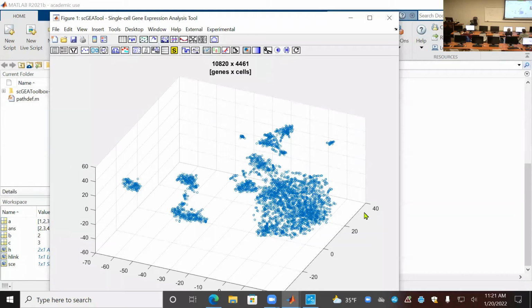Oh, you get this error message. I had it open. I think if you minimize this window, maybe you will find it somewhere else. Okay, let me show you how to put it back.